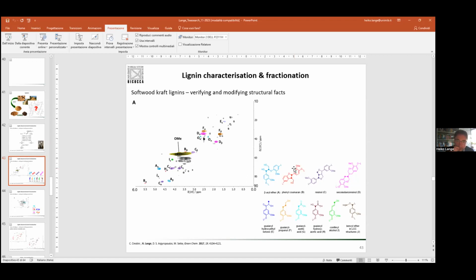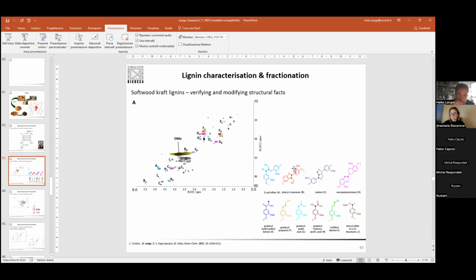So one trick that you could use is, there are two tricks. One trick is to do an acetylation of the OH groups, because that increases solubility. Okay. And there are protocols for that. The other trick is to play with the solvent system that you use for dissolving the sample for the NMR. So if you by default use, for example, DMSO. Yeah, DMSO. Then you can eventually try to mix in other solvents to work with binary solvent systems.